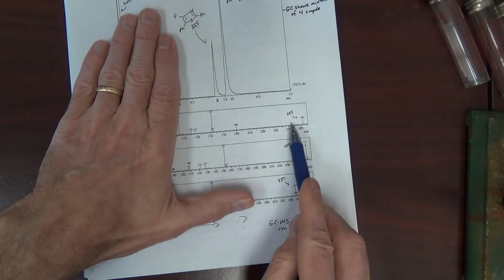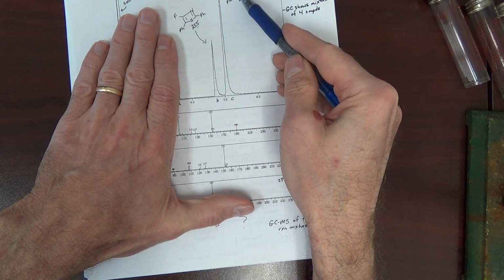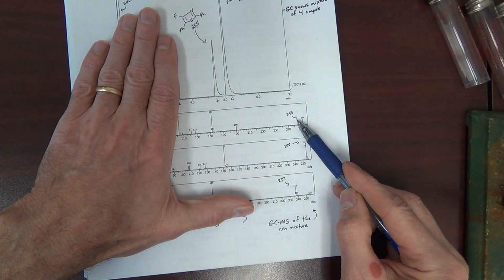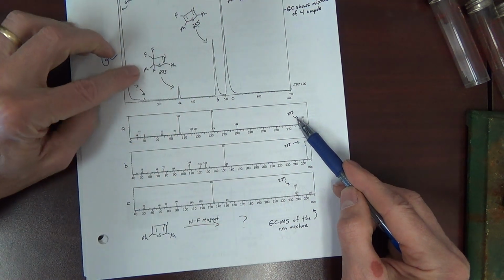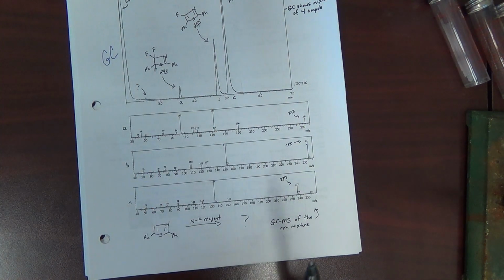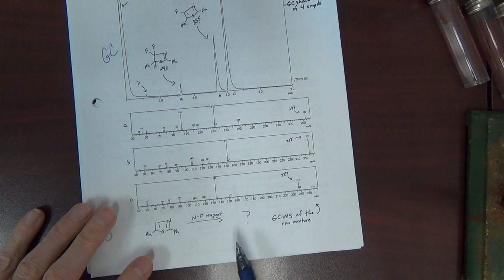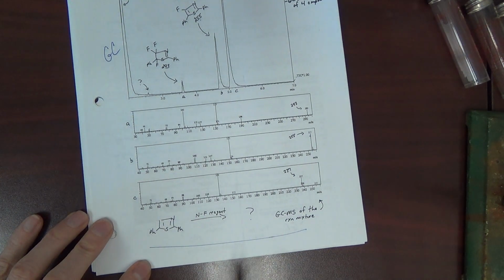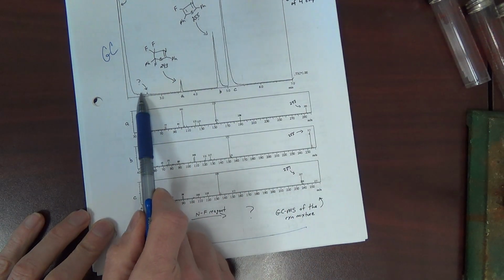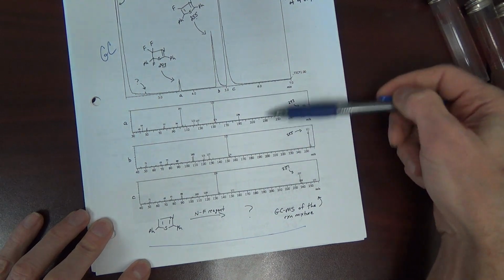Now, what did we see first? We first saw 293, and then we're like, well, how do you get a mass of 293 from this molecule? Well, if you think about it, if you add not 1 fluorine but 3, the mass will then equal 293 in this manner. And then from knowing some chemistry, we proposed this structure, but this structure would have to be proven by other ways. We really didn't look at the cleavage here. Really didn't need to. This is the reaction we did, and the GC mass spec really helped us to see that it was 4 components. I'm not sure we ever figured out what that very minor component was, but having the mass is very helpful.